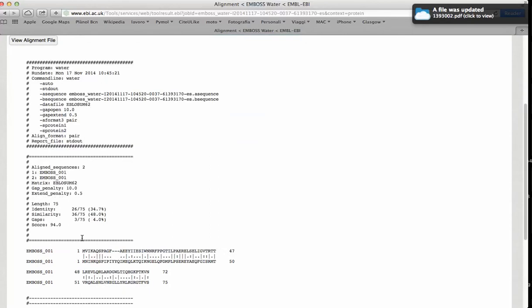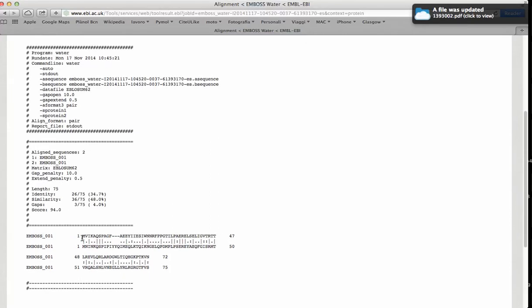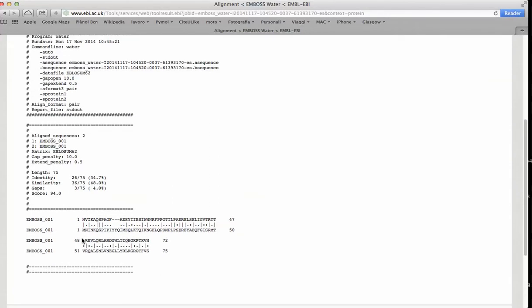Here we have the result of the local alignment. As you can see in the region of coincidence of the two sequences by the local alignment methodology, we could see that there is an improvement in the identity and similarity between the two sequences and also in the score of the alignment.